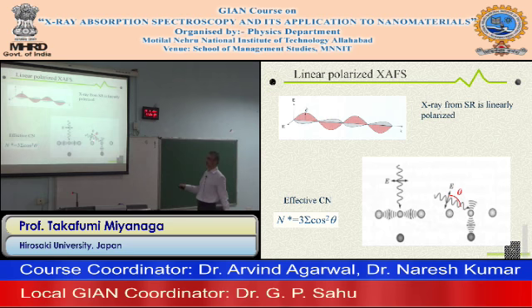Perpendicular information to the surface. But the function of the angle dependence is expressed as these equations. So the effective coordination number has these equations. So we can analyze the atomic arrangement of the surface, including the surface or perpendicular of the surface.